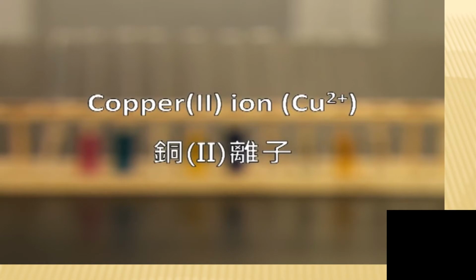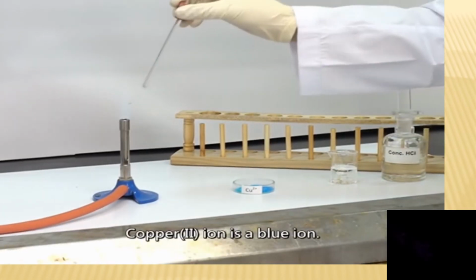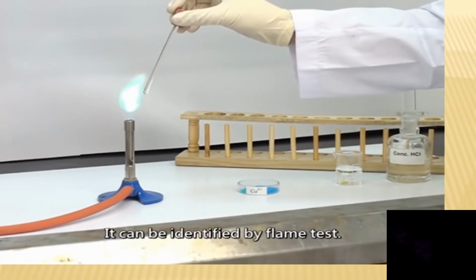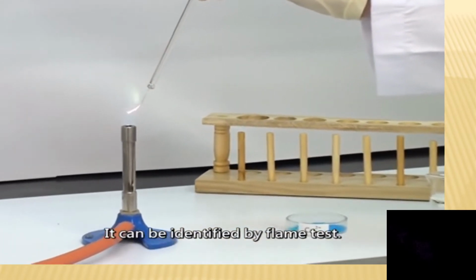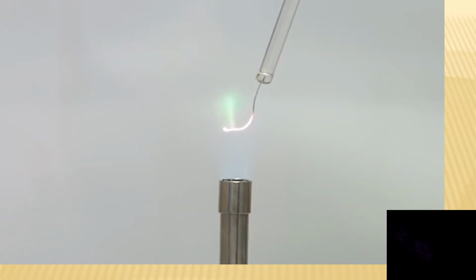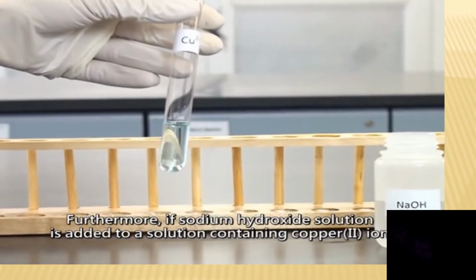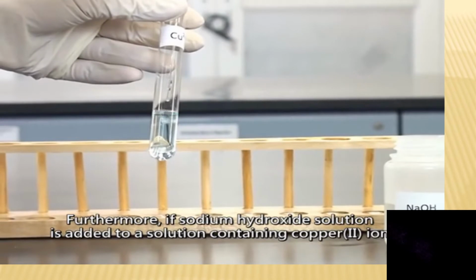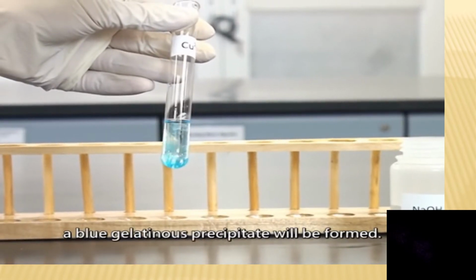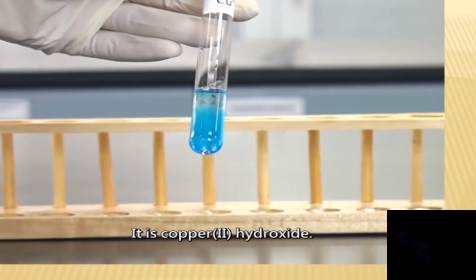Copper 2 ion. Copper 2 ion is a blue ion. It can be identified by flame test. In this test, a blue-green flame is produced by copper 2 ion. Furthermore, if sodium hydroxide solution is added to a solution containing copper 2 ion, a blue gelatinous precipitate will be formed. It is copper 2 hydroxide.